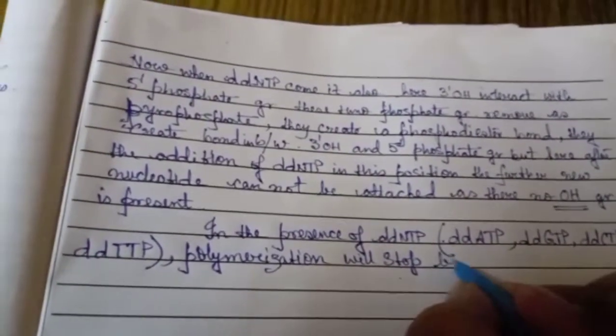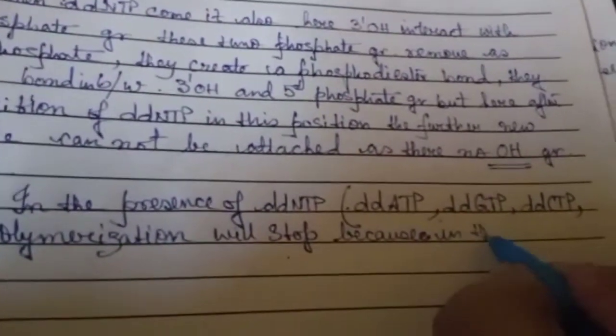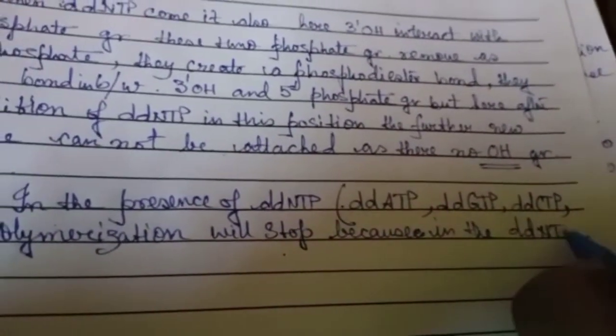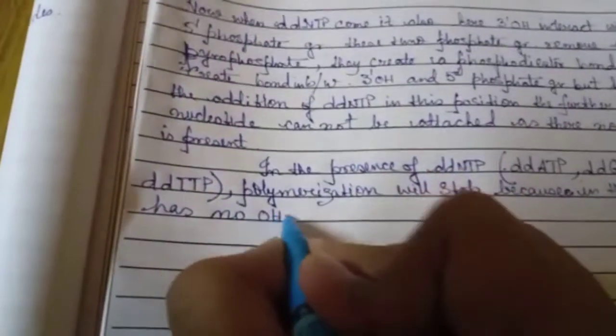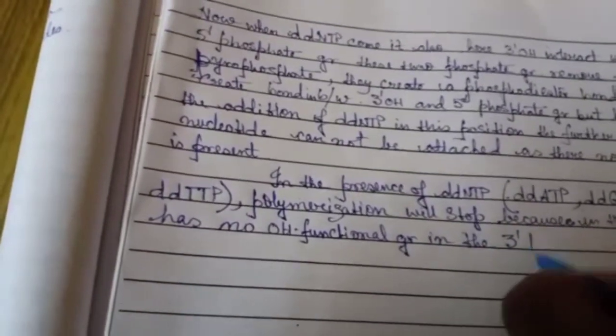Here the primer is essential for DNA synthesis. The primer provides the initial 3' hydroxyl group to form a phosphodiester bond with the incoming dNTP or deoxyribonucleotide.